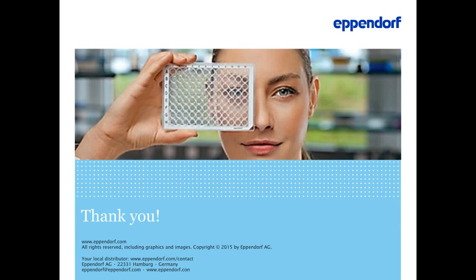Thank you. The next one: is there a good way to test our consumables for the presence of these agents, besides testing in our assay, which may be hard to run? Chemical tests, absorbance? Yeah, as mentioned, one of these very simple tests might be the UV absorbance test, which is basically incubating water and doing a spectrophotometric measurement. This is not covering all of the leachables, so as I mentioned already, it might give you some indication, but I would still be cautious. The best, of course, would be HPLC, but this is a costly and very complex method. In the end, the best way, and this is one of the recommendations from this webinar, is to be on the safe side and purchase consumables from manufacturers which do not use critical additives.